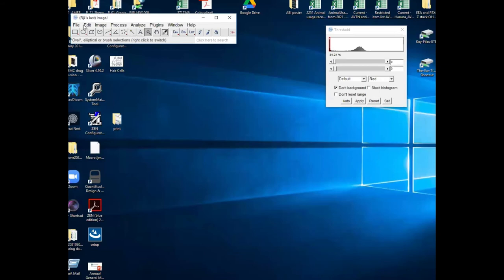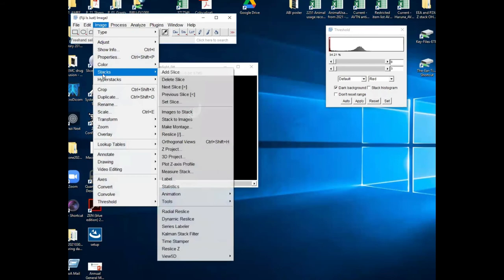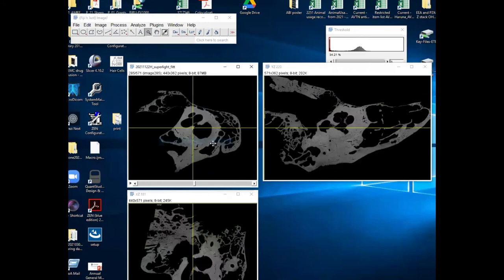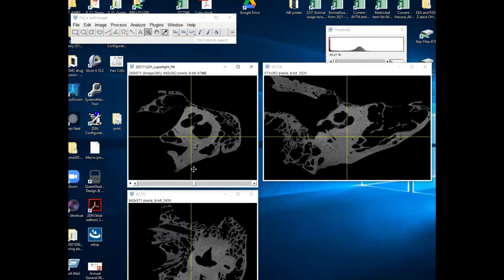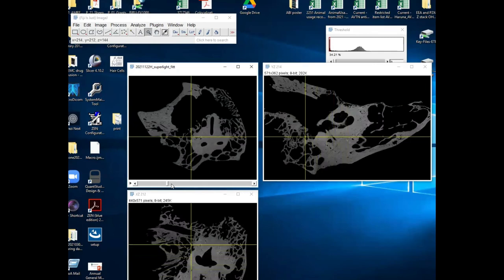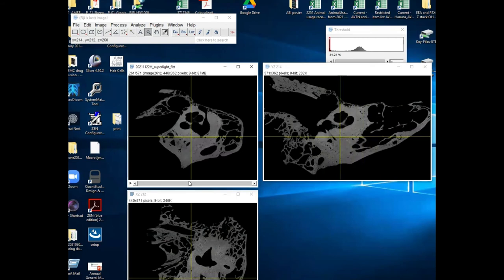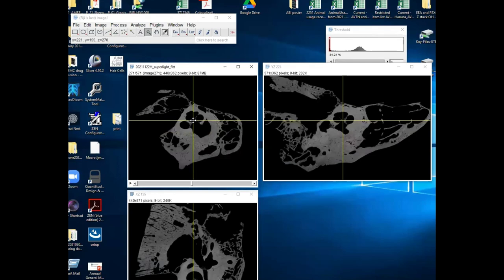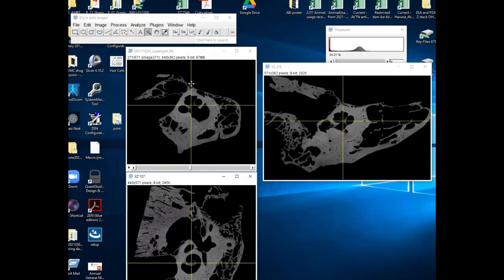Now we can do the same thing here. So if we import the image sequence to ImageJ, there are many menus under Stack. So we can go to Orthogonal Views, which does the same thing. So we can cut a cross section through. This line cross section view is over here, and this line cross section view is over here. And we've got this different scale. If we focus on the other sphere, let the sphere be across here, and across here on this side.